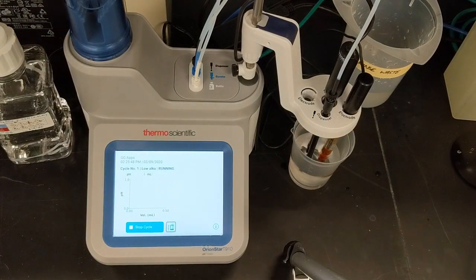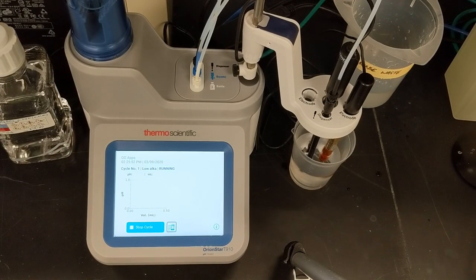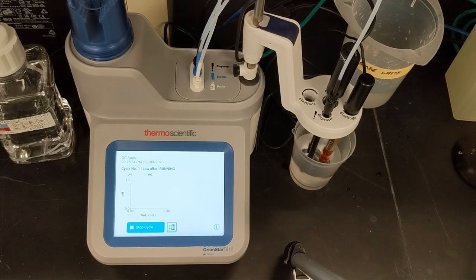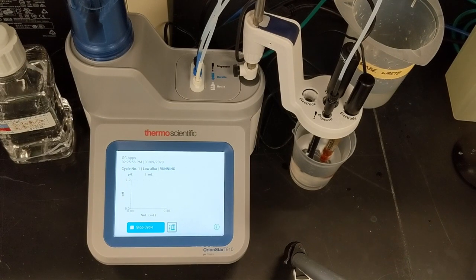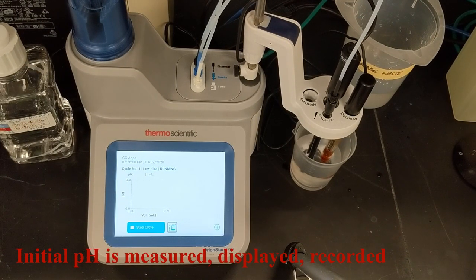The titrator begins a pre-stir and starts measuring pH. The progress of the titration will be shown live on the screen. When the pH reading stabilizes, the initial pH of the sample is displayed.